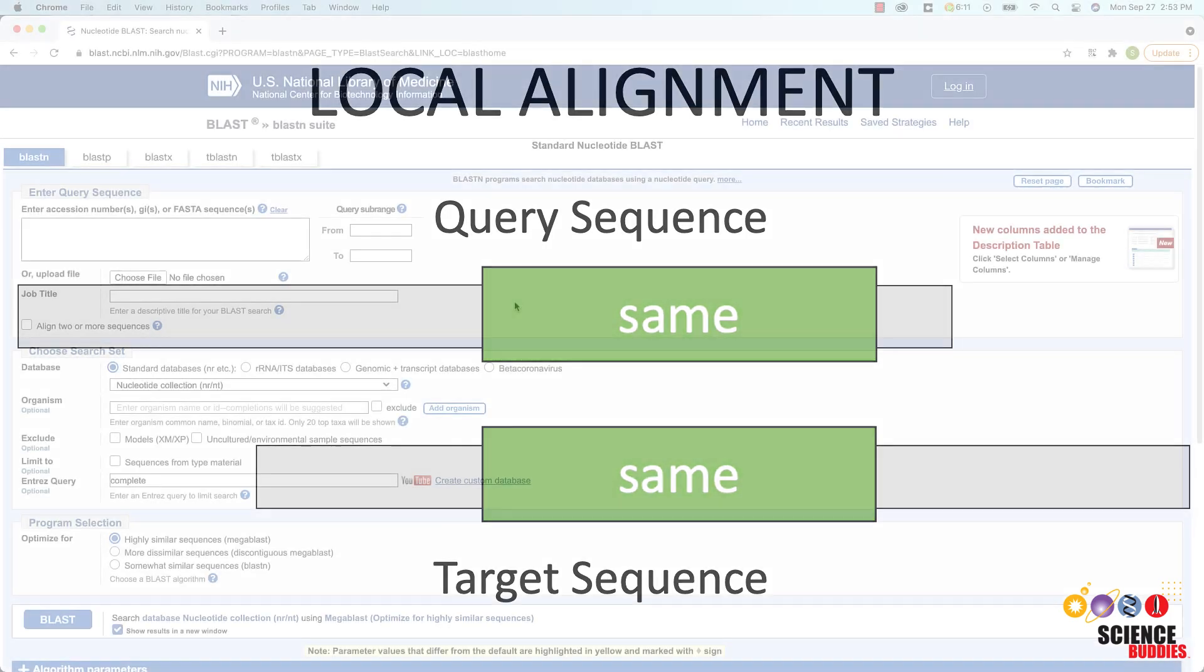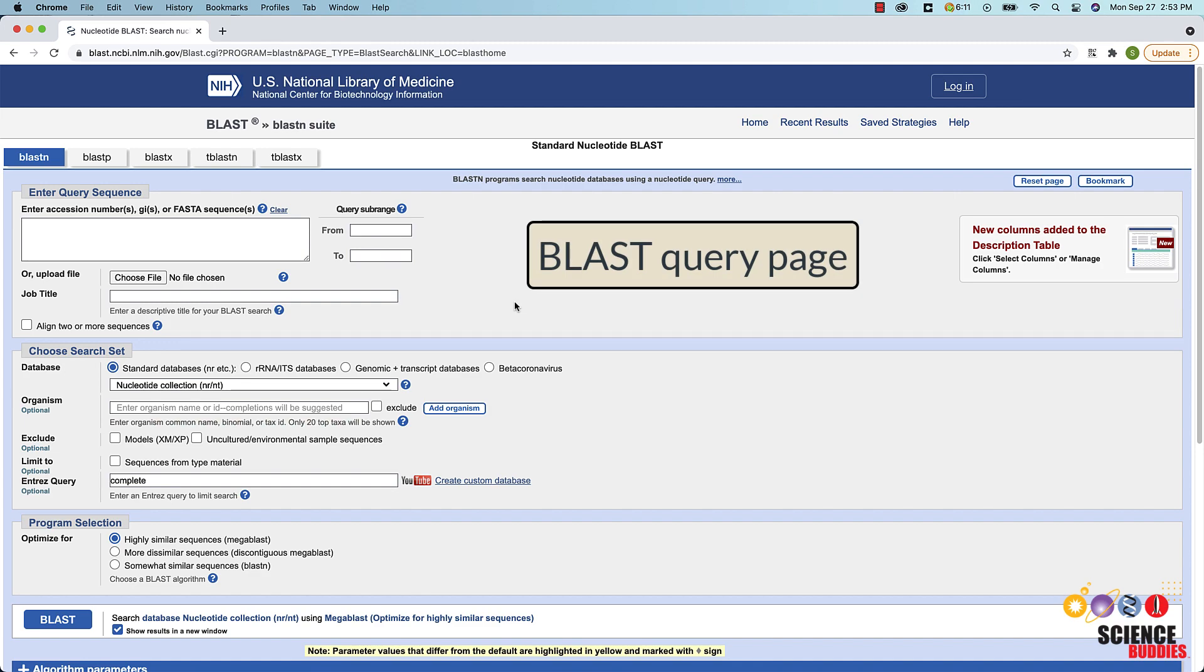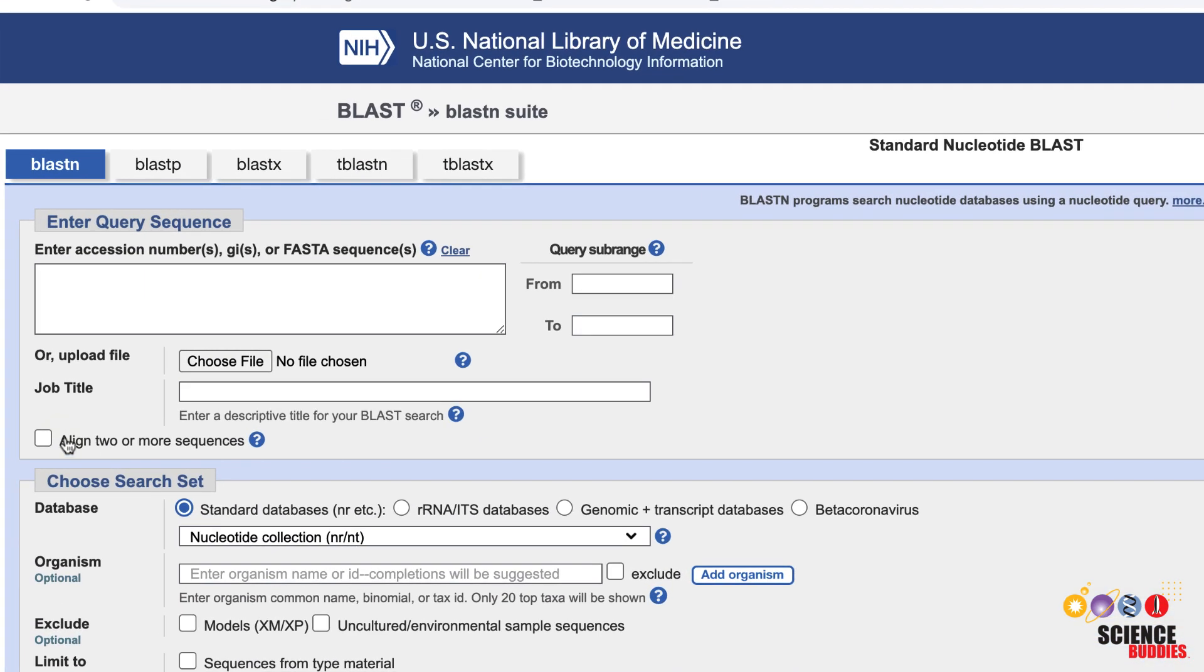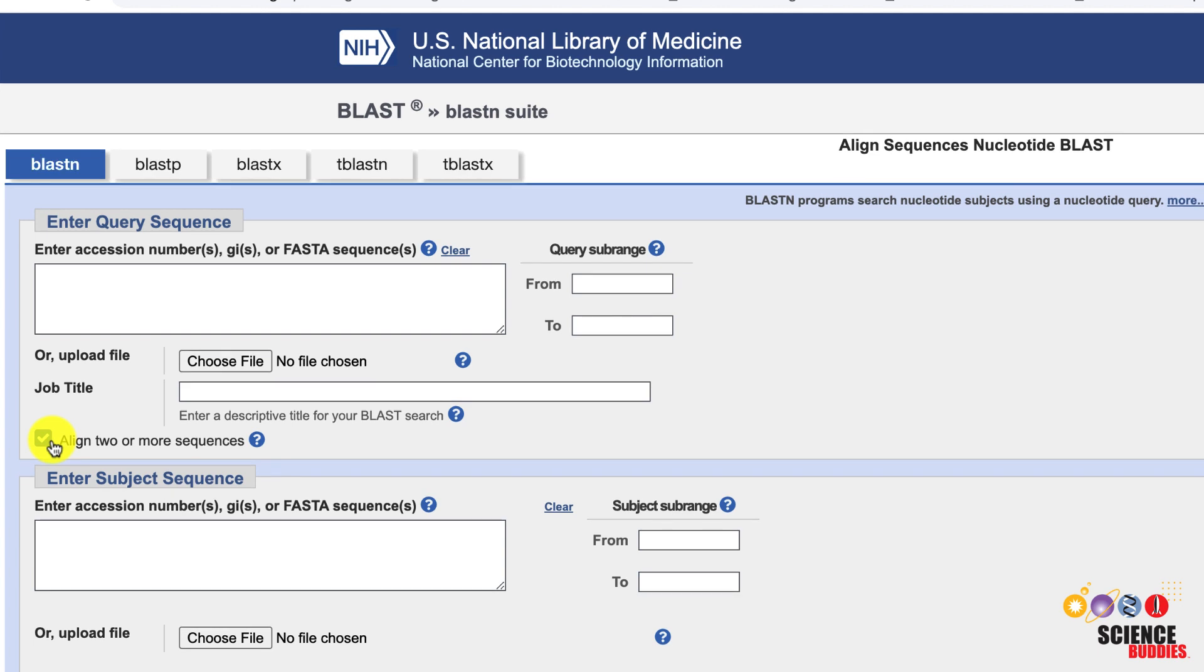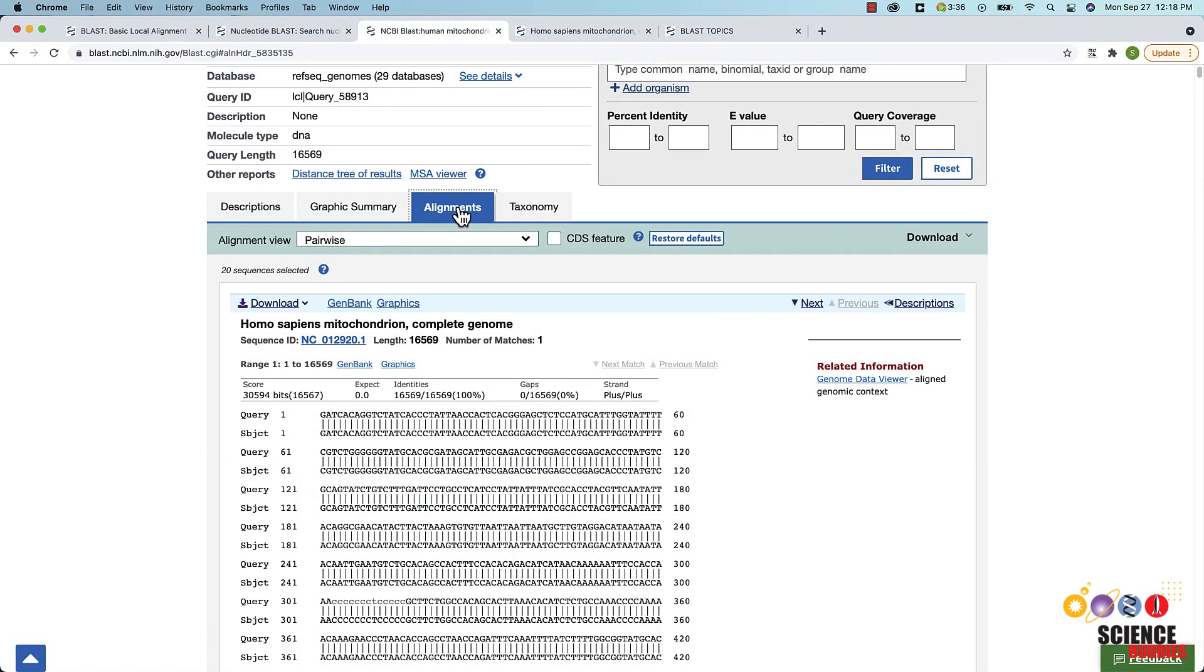Within BLAST, you can do a local sequence alignment on the BLAST query page. Check the Align two or more sequences box and the page changes so that you can enter the query sequence and the subject sequence that you want to compare. Click the Alignments tab in the resulting BLAST report to look at the alignment of both sequences in more detail.